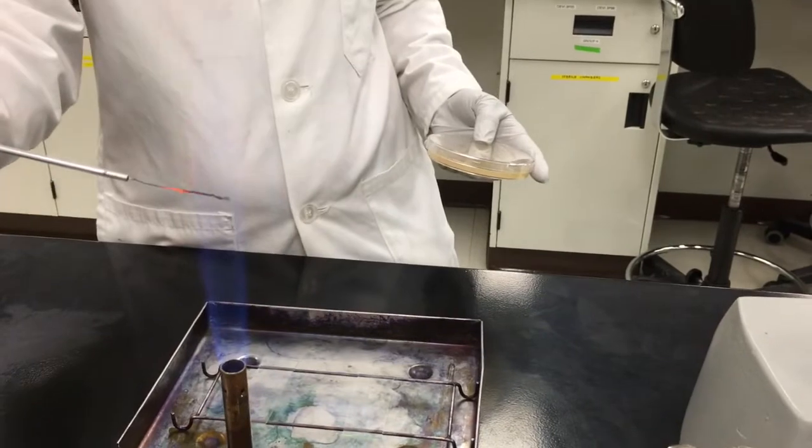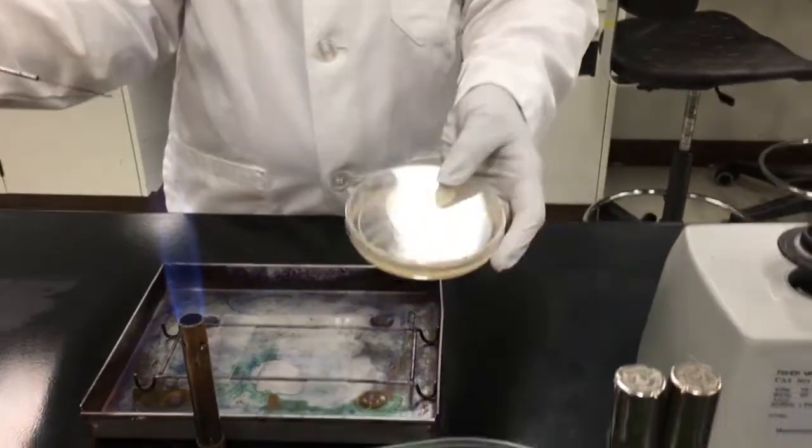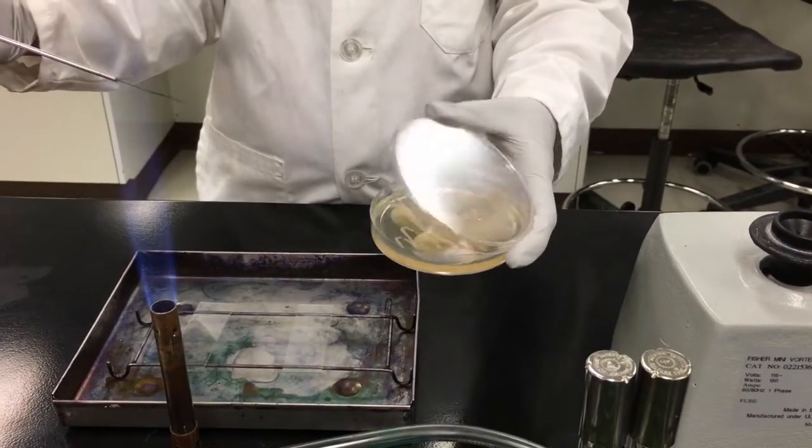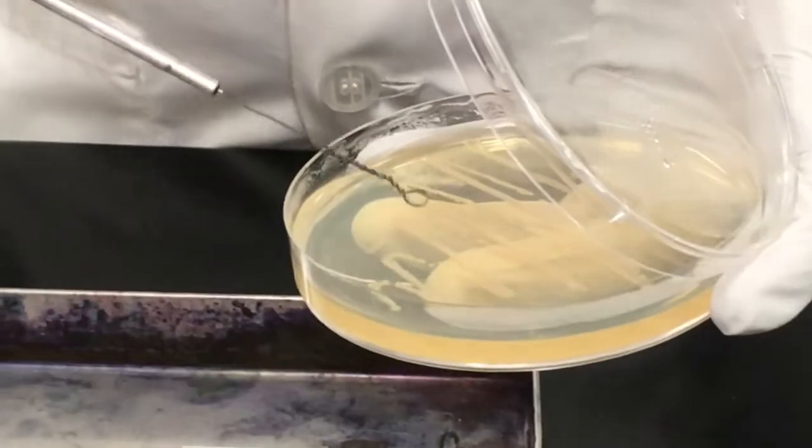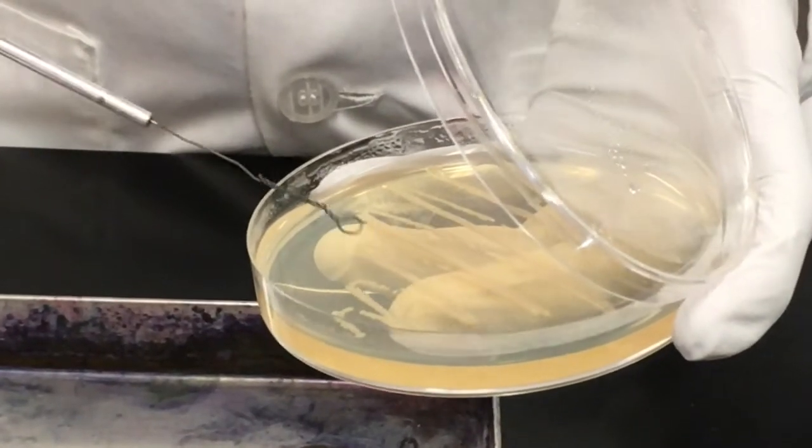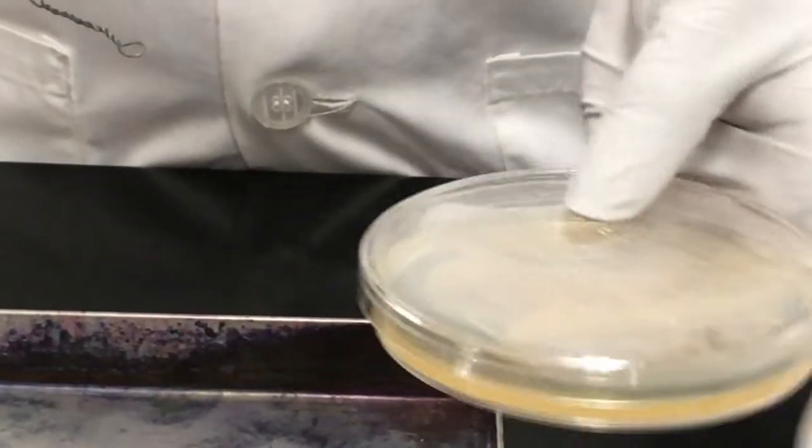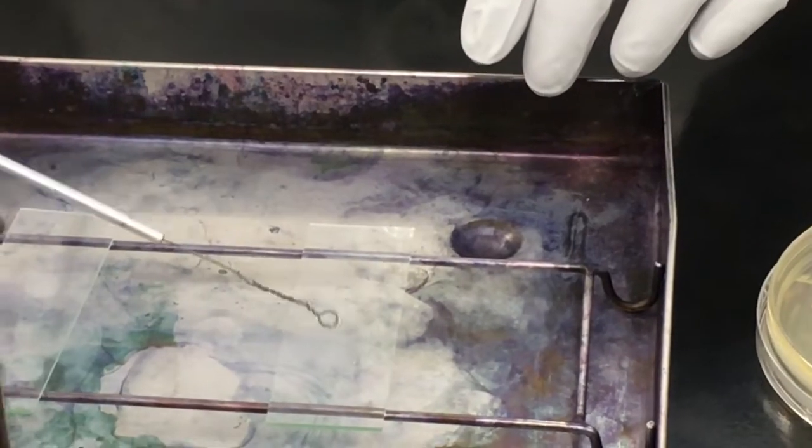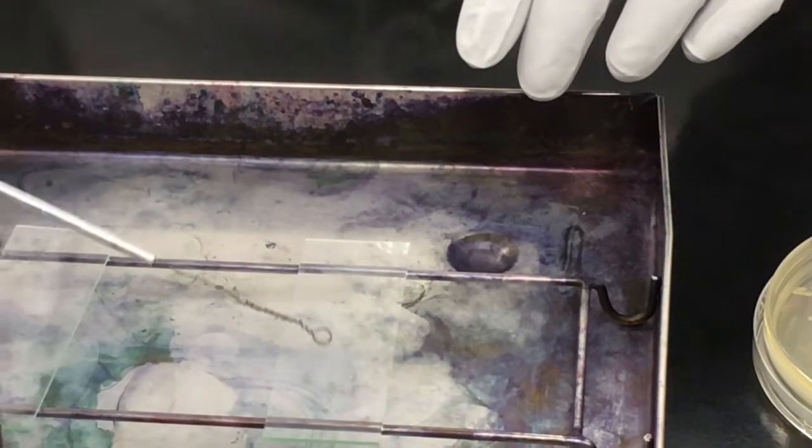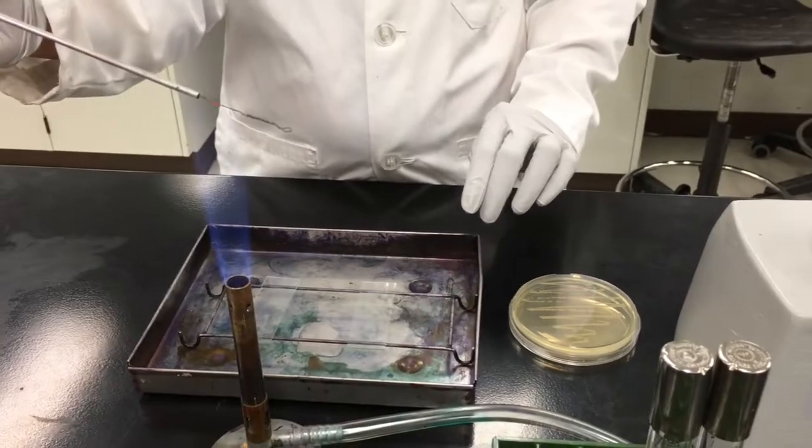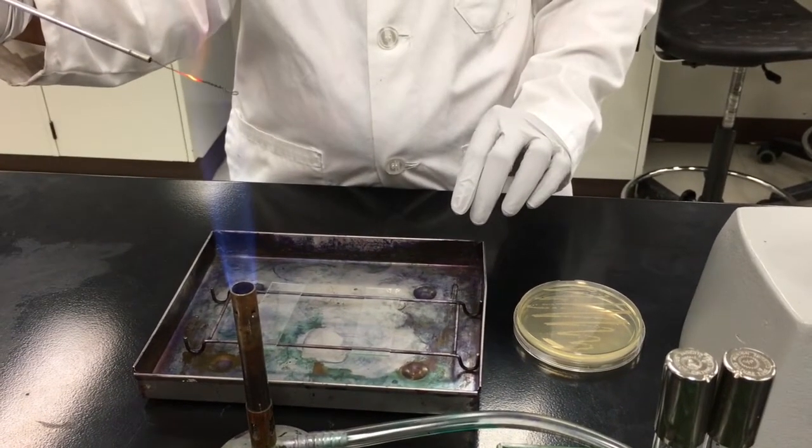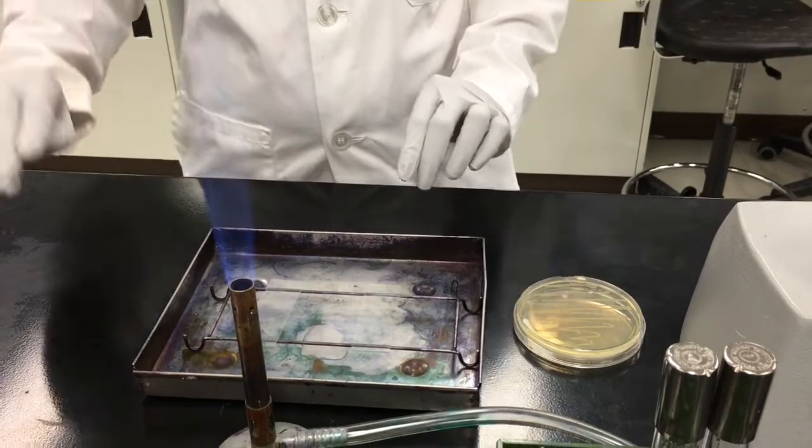We then re-sterilize our loop and open the petri dish containing our bacterial culture very gently. Once the loop is cool, we gently touch the bacterial culture taking just enough for visualizing under the microscope. You should not see a large amount on your loop. Spread this around on top of the slide in the distilled water and re-sterilize your loop prior to placing back on the bench top.